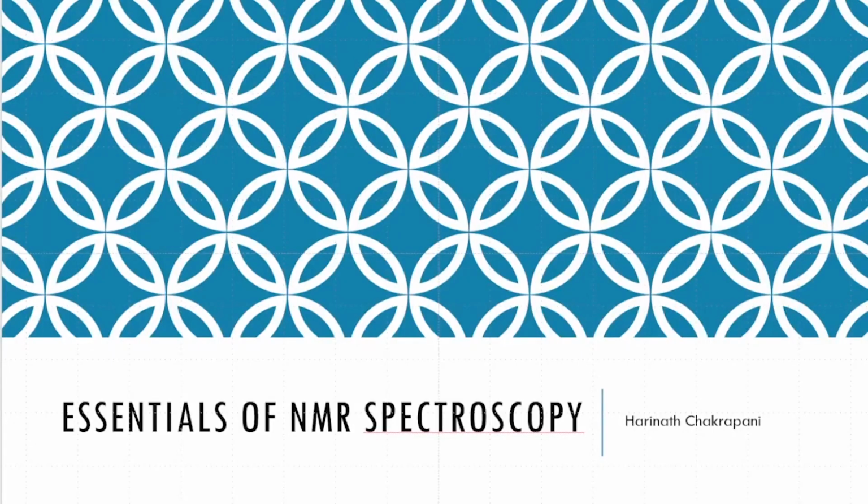Okay, so in the previous lecture, we spent quite a bit of time trying to understand the various trends of proton and carbon NMR. So now what we'll do is spend some time trying to understand the NMR pattern of benzene. We will be spending quite a bit of time on aromatic compounds in this course, and therefore it's quite useful.